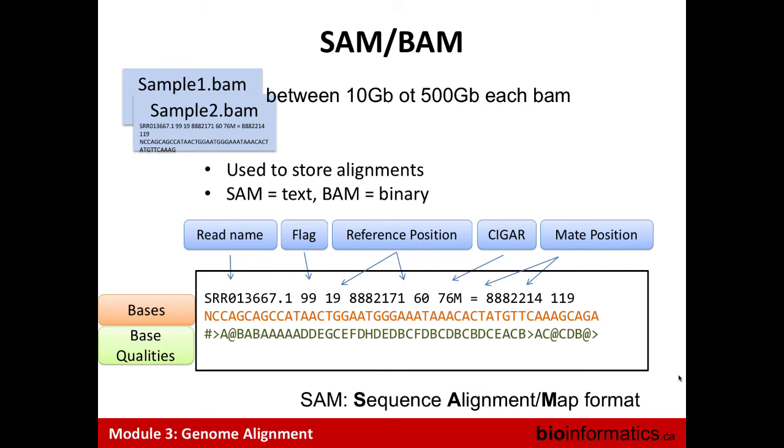For example, I will have here 4 matches, here I've got 1 deletion, and here 2 matches. Here is how the read has been positioned compared to the sequence.